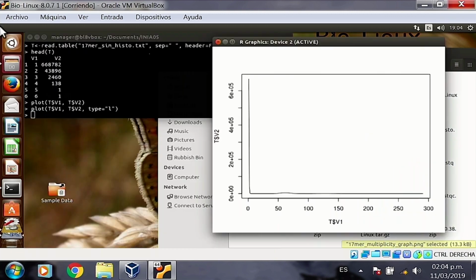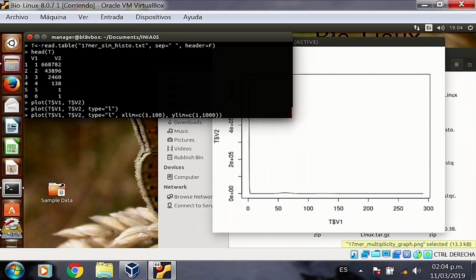Then we just zoom in. I'm just playing around here. I'm just guessing at this point. I'm seeing like a small hump here, so I'm going to show only this spot here. I'm going to zoom in. Yeah, and how do I do that?